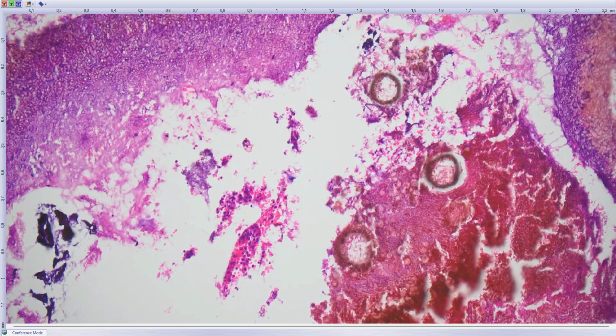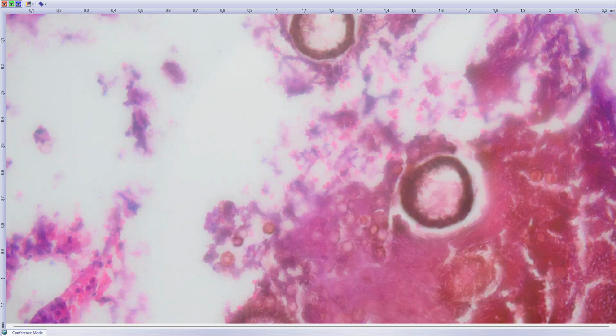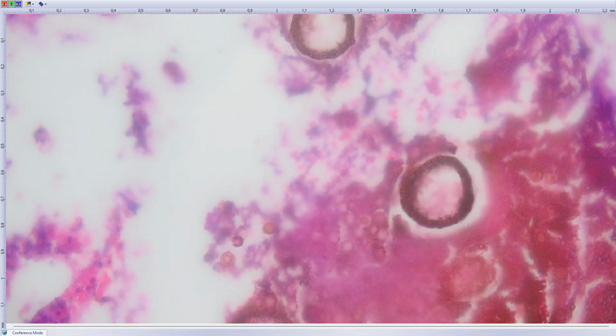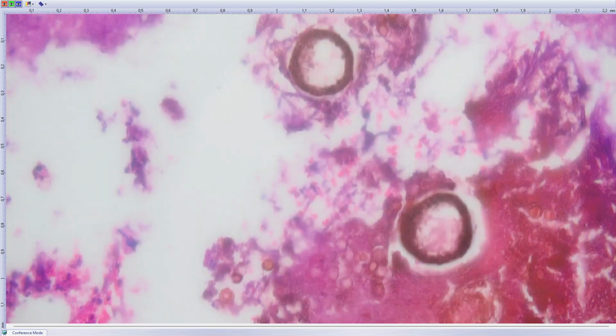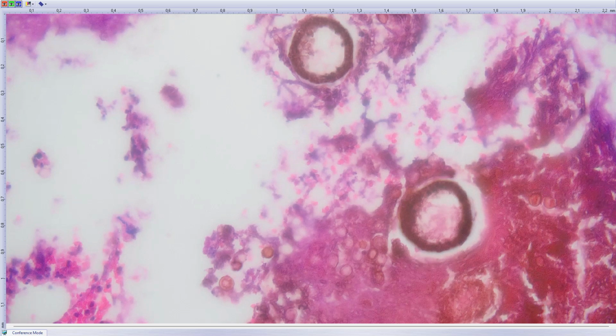And moreover, there were these brownish cystic structures here with some spores within these cystic structures, and moreover there are some bigger, roundish translucent but thick membrane structures. These are called, I believe, Hull cells.